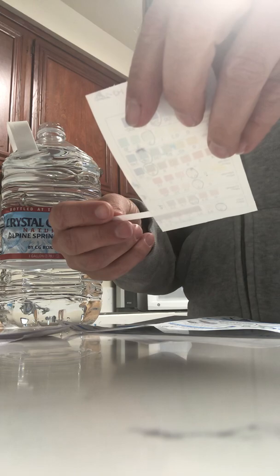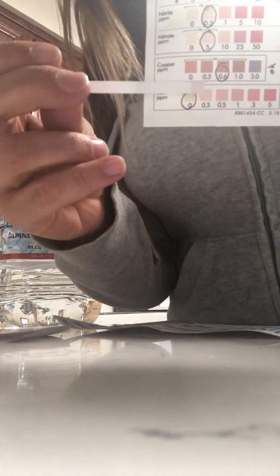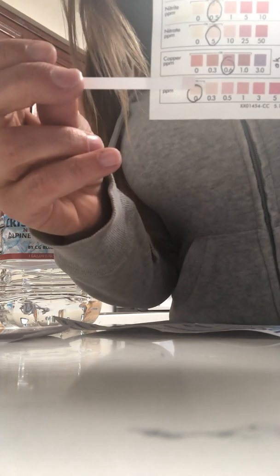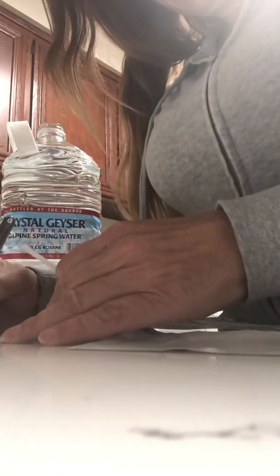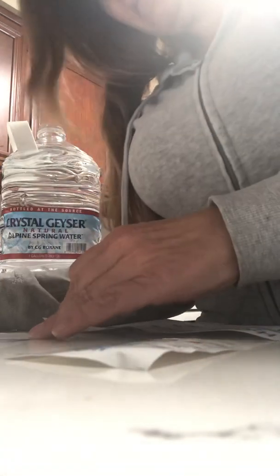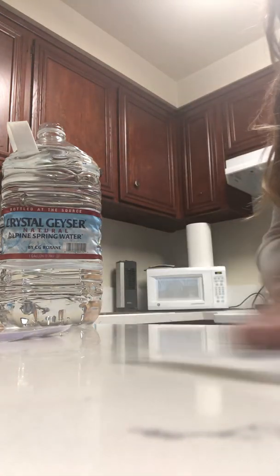Okay, let's look at it. So iron — nope, it's on the zero, I think it's on the zero — it's like an in-between color. Don't worry about my black circles, that's from the tap water. I think it's the first one, so it's got zero — zero iron. Isn't that amazing? Crystal Geyser passes — zero for iron.